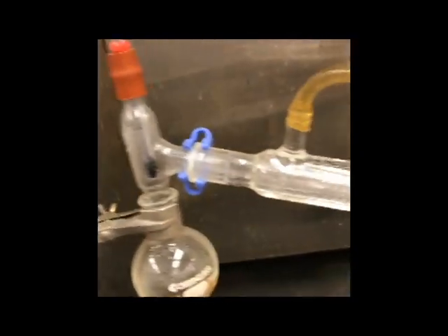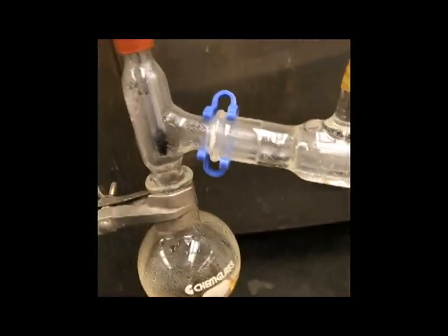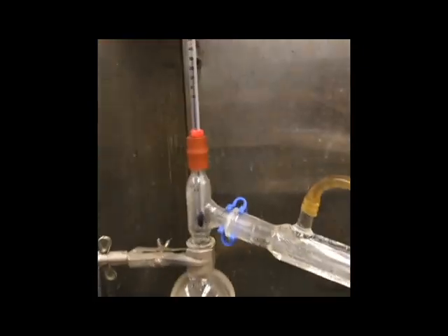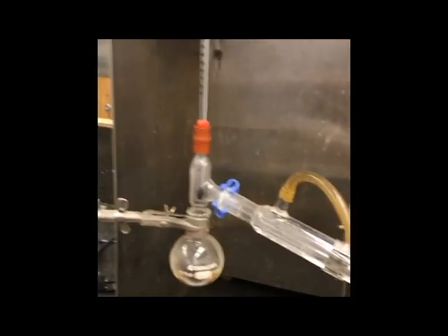And then we go over, see a little bit of condensation in here left over. And this is how much volume we have left. So you can see it's a little bit cloudy. So there might be some impurities in there, like water or other stuff. Should be a clear solution, but we're gonna take care of that pretty soon with an extraction. So that's how we ended up after our distillation, and our final temperature was 85 degrees Celsius.